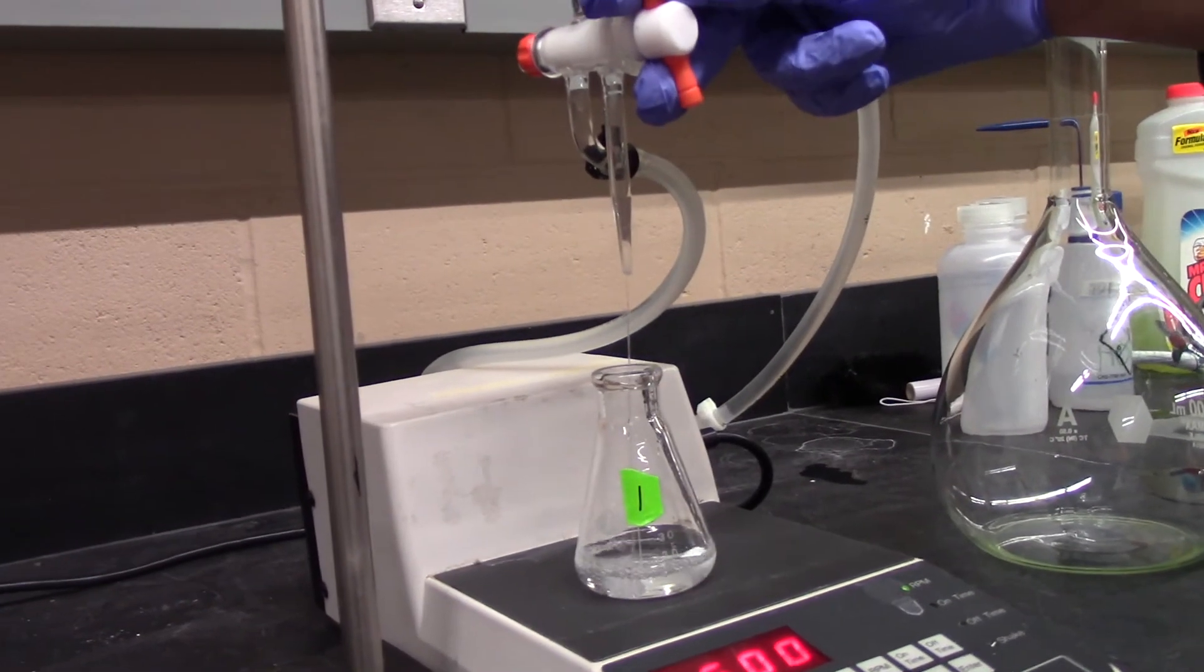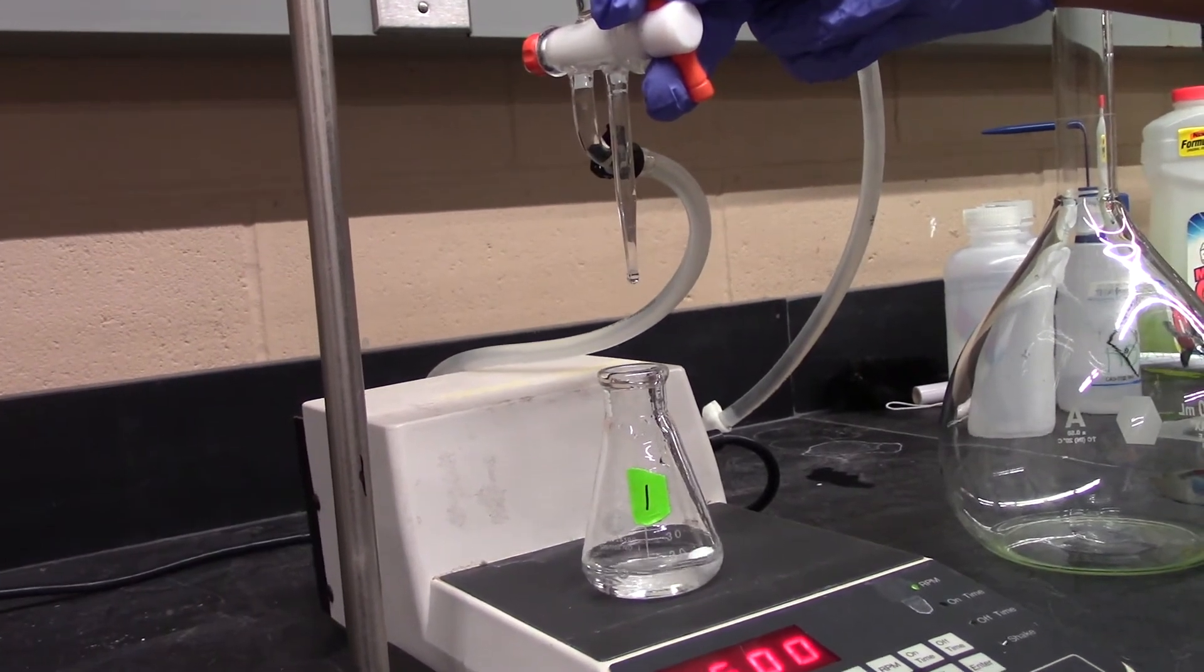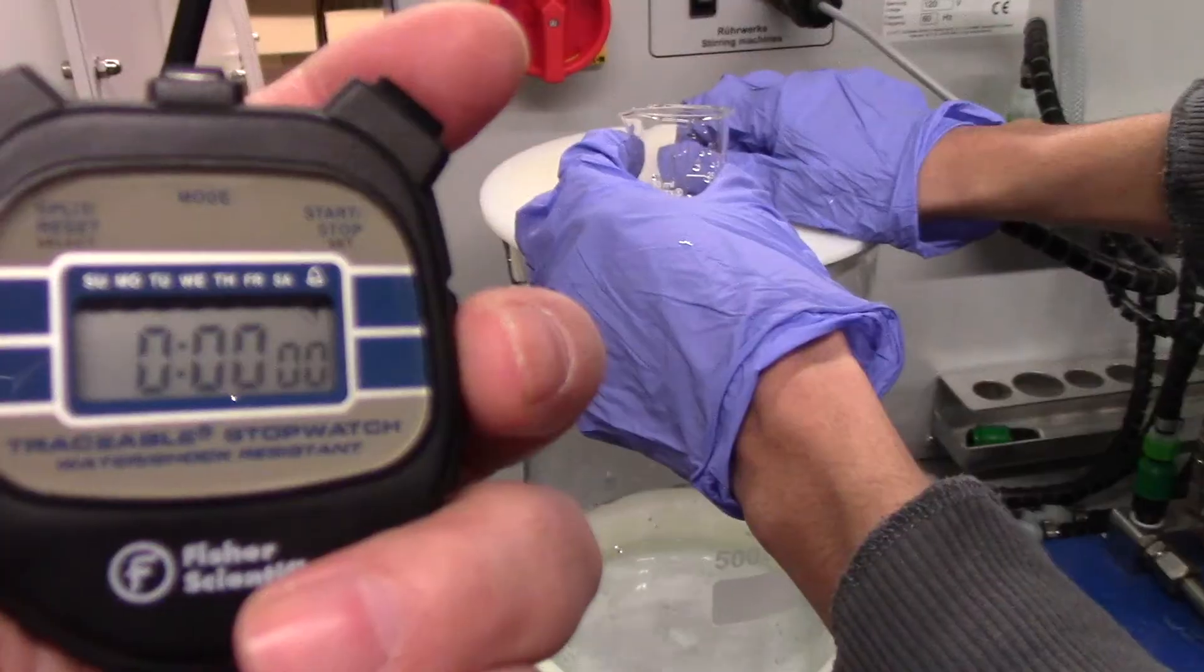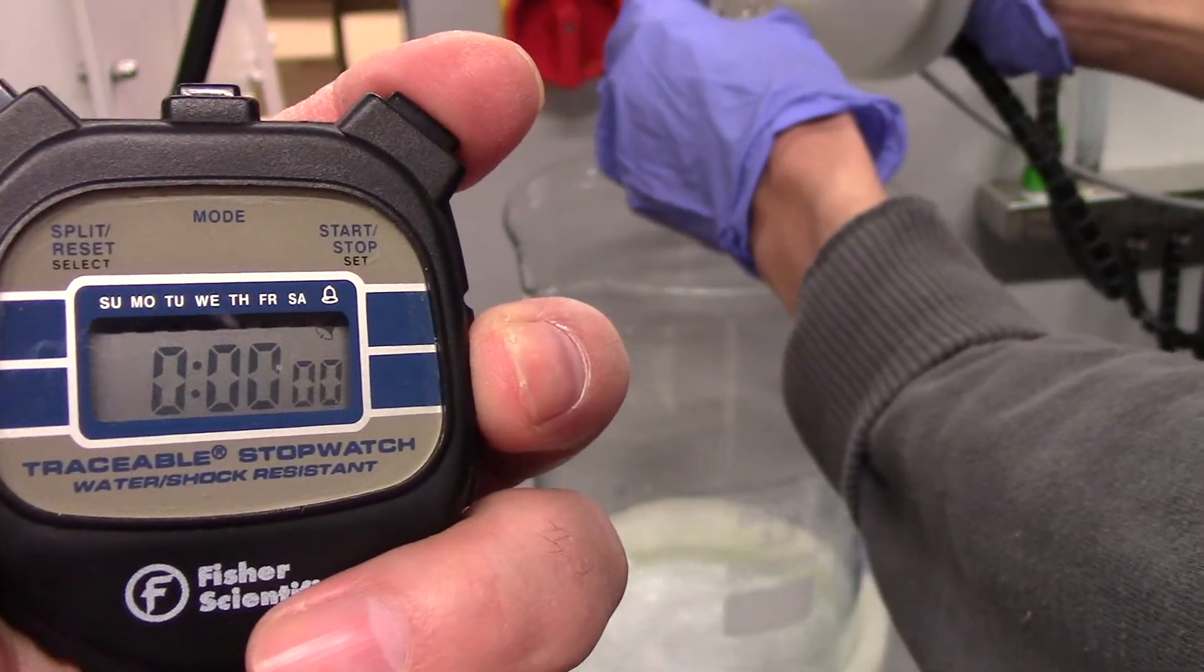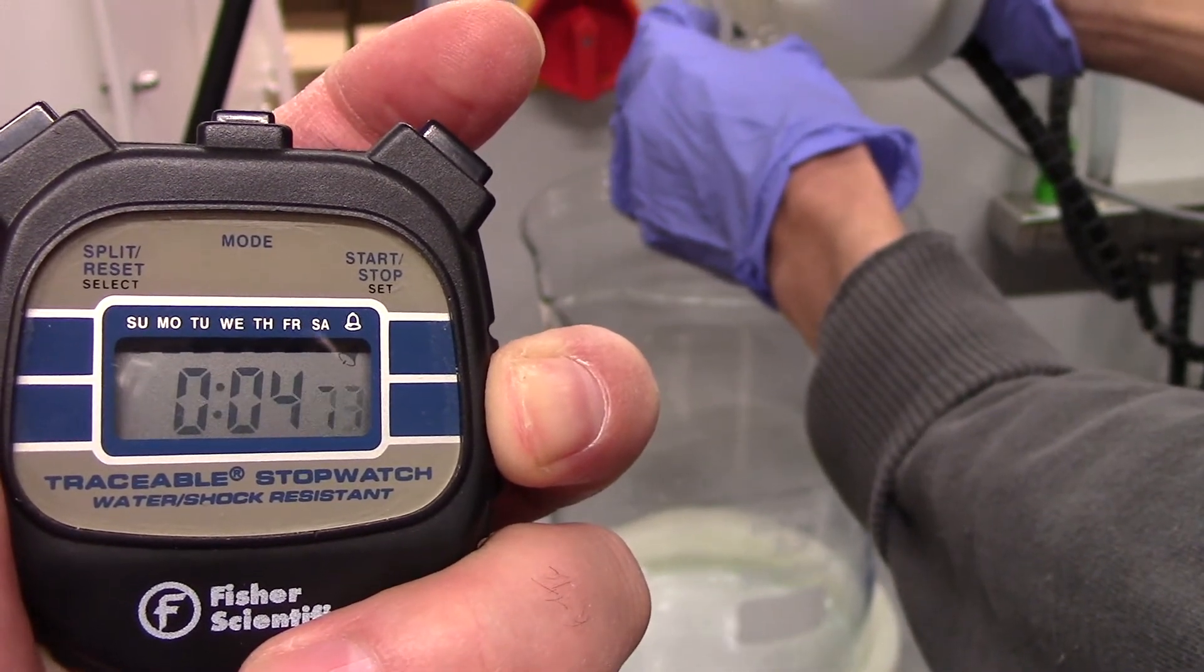The quenching process should follow the same steps used to standardize our solutions in the beginning, titrating until a distinct color change is observed. The product dripping out should also be collected in a beaker over a 60 second period to manually determine the output flow rate.